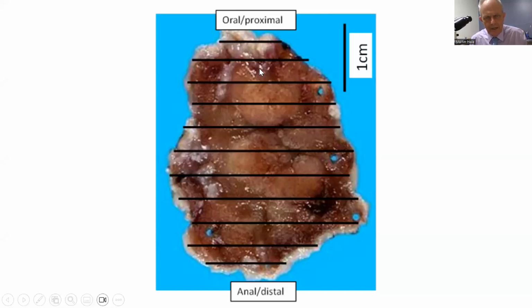And when the technologist cuts those sections, that is a 4 micron slice, okay? So every block that is sectioned, if we've got here, for example, 1, 2, 3, 4, 5, 6, 7, 8, call it 10, 11, or 12 sections, we are examining histologically, let's make it 10 sections.